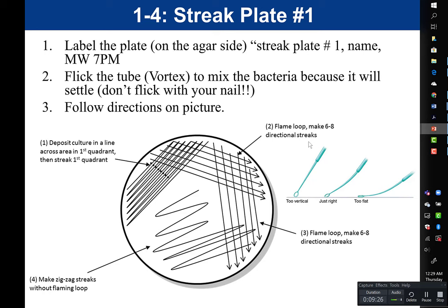Don't fling or shake your loop to try and get it to cool faster — that would be a risk for contamination. Just hold your loop next to the flame and let it cool.